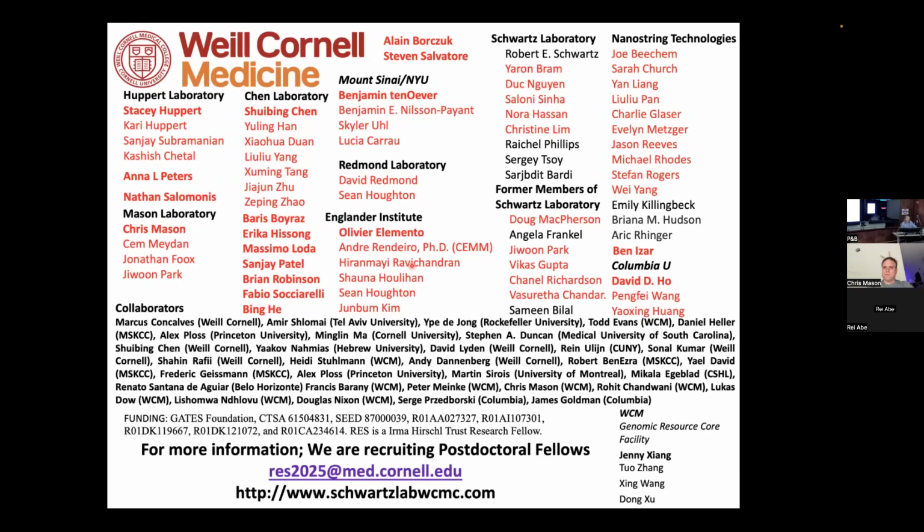There was this crazy paper where they did every omic technique you can name, they did it for the liver. It was quite interesting. The problem is, this paper was really trying to push DESI down to half a micron.